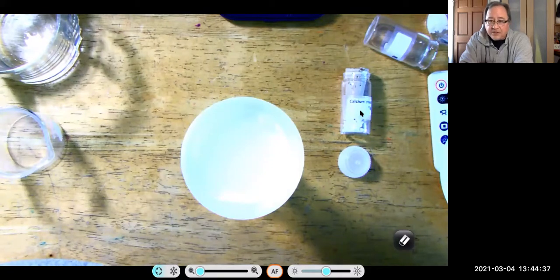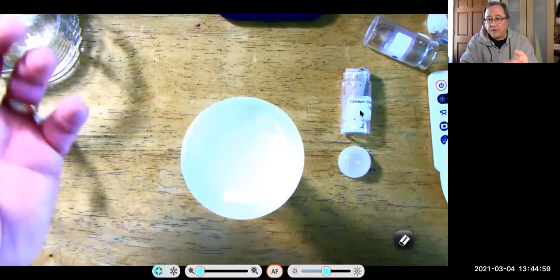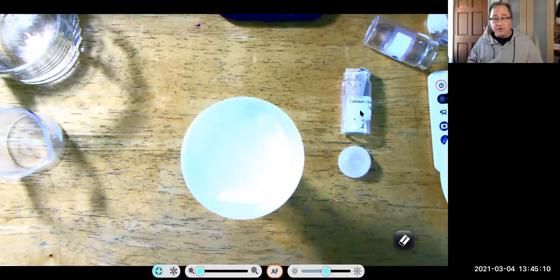I want you to imagine that you're washing clothes. After you go through the wash cycle, before the rinse cycle, and your washing machine is spun, you know that your clothes still have detergent in them because there was detergent in the water. And when you spin it, your clothes are still wet. They're wet with that detergent-type water. So how do you rinse that detergent out? Well, you add more water and you agitate to free the soapy solution from your clothes, and then you rinse again.